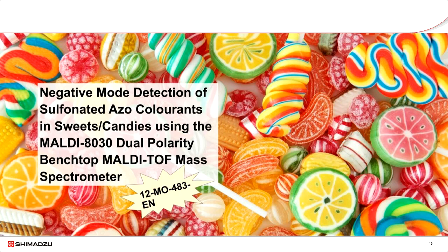The third application I will present today is about synthetic food colorants in confectionery products. So let's see how MALDI-TOF MS can be useful. An application news is available for this application.